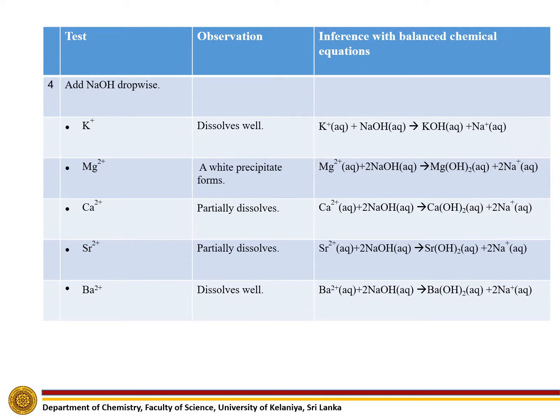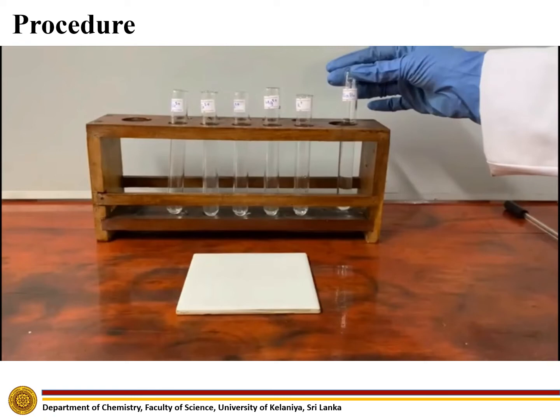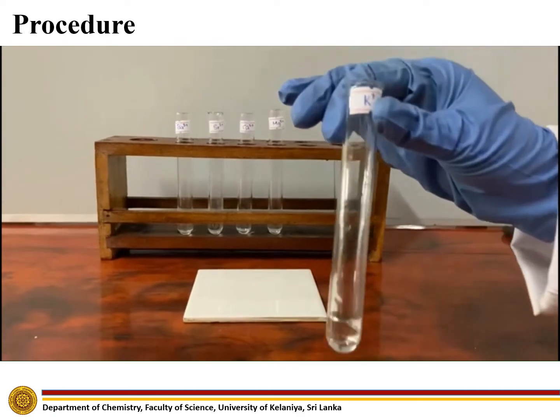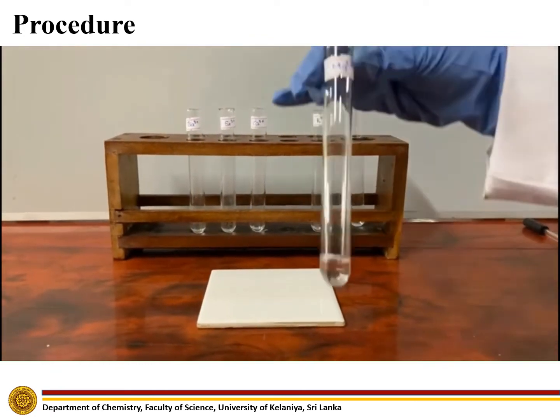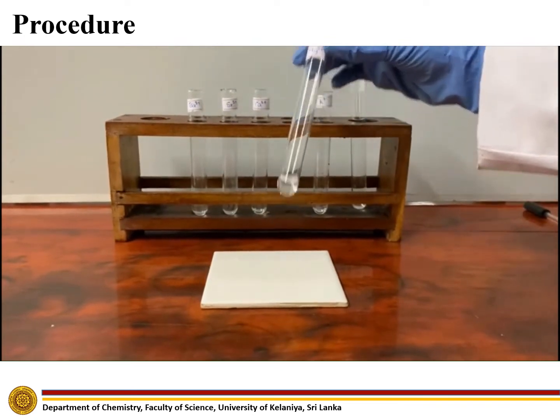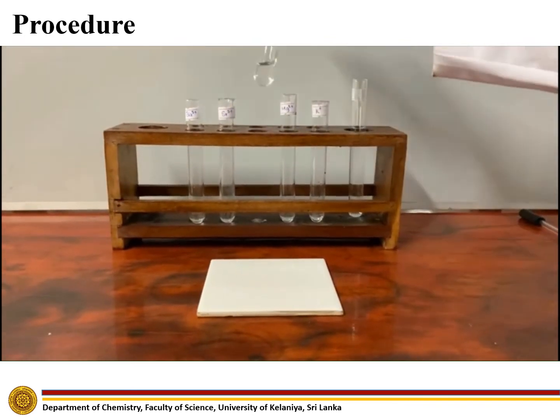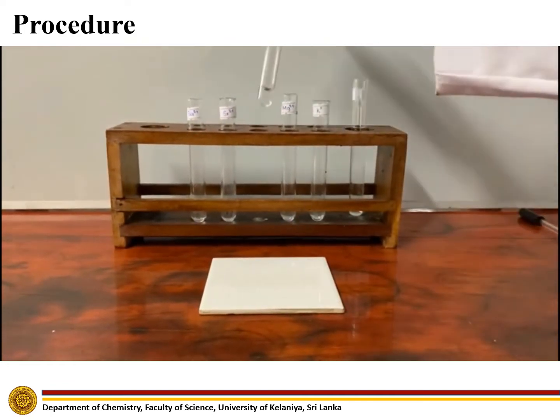In the next part of the experiment, when we add sodium hydroxide dropwise, only potassium and barium ion dissolves well. But magnesium will give a white color precipitate, which is magnesium hydroxide. Calcium and strontium partially dissolve in sodium hydroxide solution.